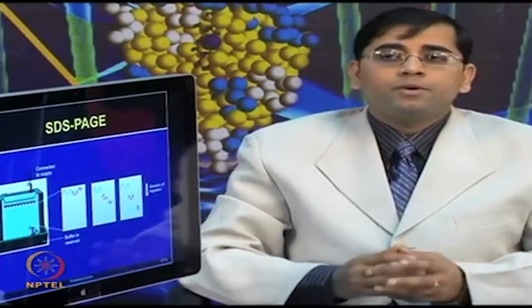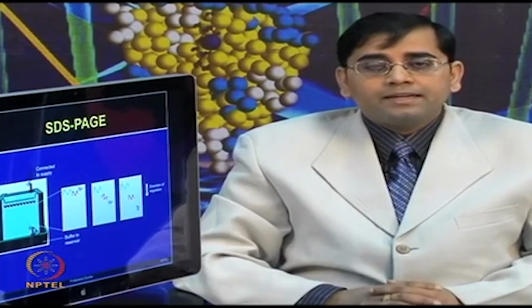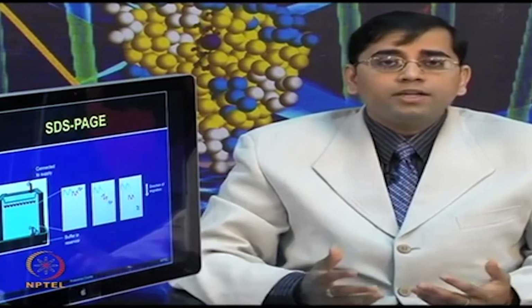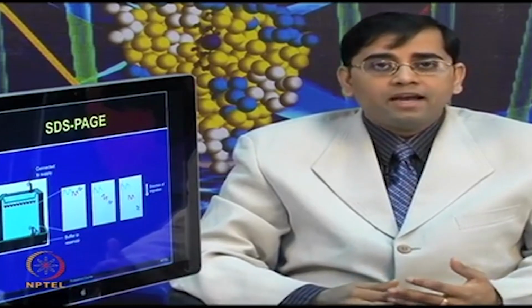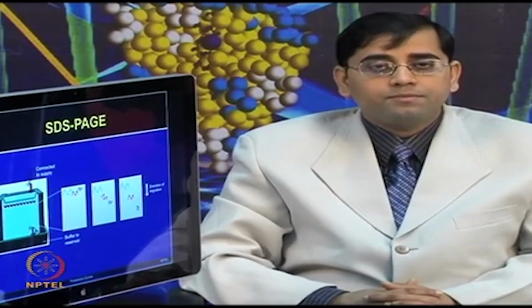Since we are talking here about two-dimensional gel electrophoresis workflow, I think it is important to clarify that in 2DE, when you use SDS page, you do not need to make these wells by adding a comb, because you already have a flat IPG strip which has done the first dimension protein separation.